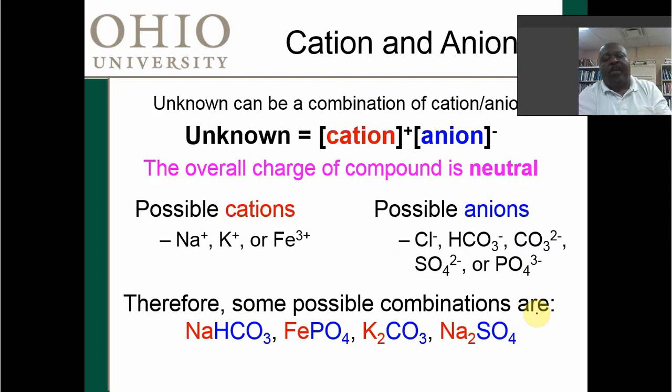Moving right along. So, here's what we have. Our possible cations. We can't just start with the whole group because we can't do it in the lab time that we have. So we are telling you that in this case our possible cations are sodium, potassium, and iron 3+, the ferric ion: +1, +1, +3.